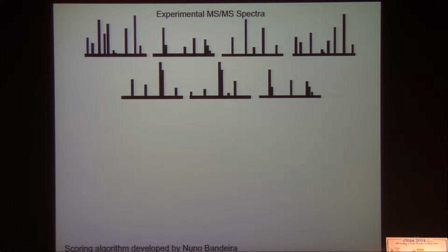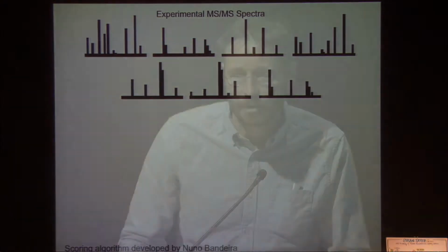And what we have begun to do is think about how we make comparisons between these molecules. It's very common to do this in gene sequencing or with gene repositories like GenBank, where you compare your protein or DNA sequences of interest, find some other matches to that, and infer a function with respect to those correlations. We can begin to think about doing the same thing here.